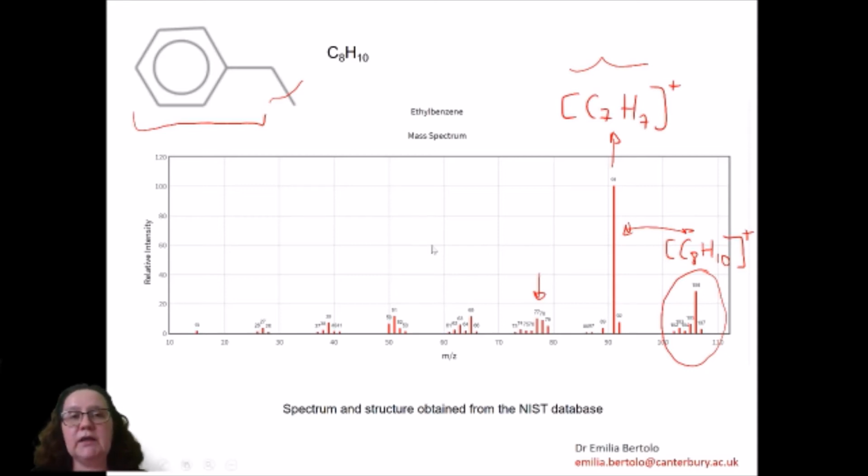So if I go to the isotopic distribution calculator, it will tell me what would be the most abundant of those peaks, and I will hopefully be able to confirm my idea that that's likely to be the ion corresponding to the benzene ring.